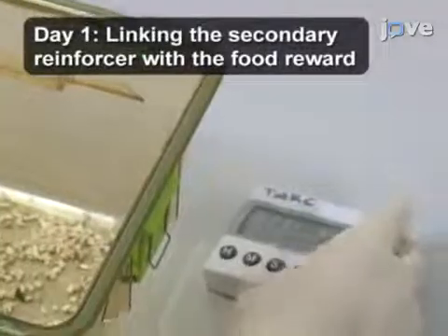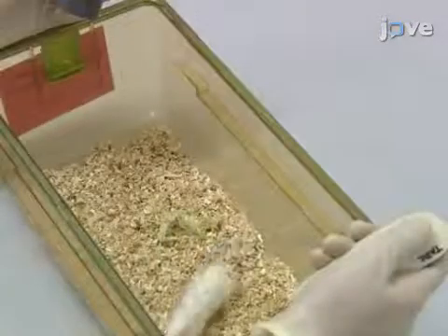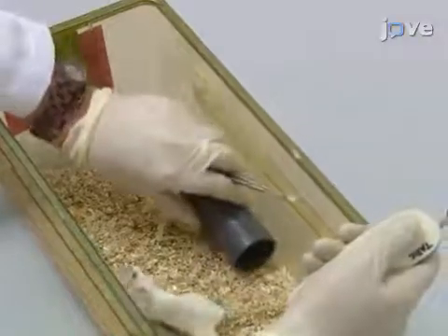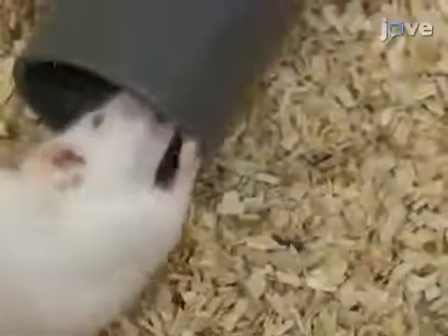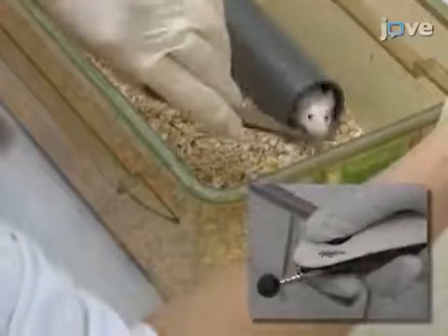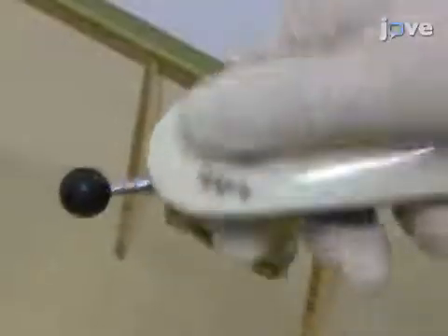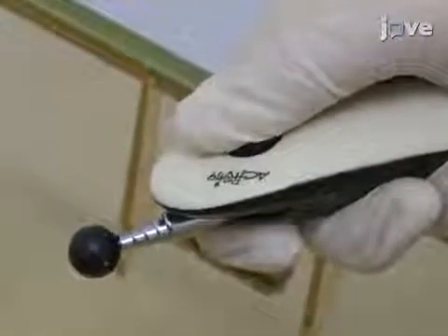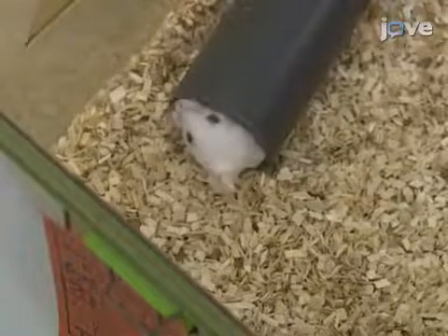To start the training, set the timer to 5 minutes and press start. Add the mouse tunnel to the home cage near a wall, then wait until the mouse inspects the tunnel. As soon as the mouse enters the tunnel, click and present the reward at the end of the tunnel. While the mouse sits and feeds on the reward in the tunnel, continuously click for 15 seconds. As soon as the mouse leaves the tunnel, repeat the session again.